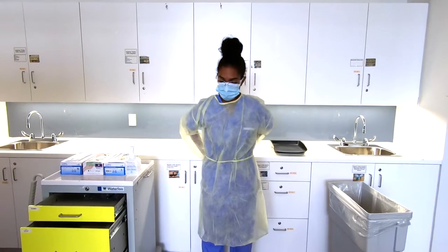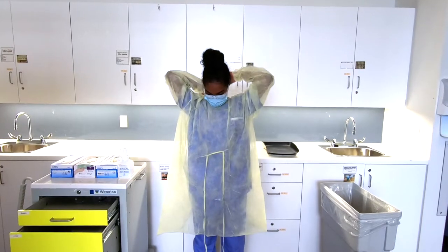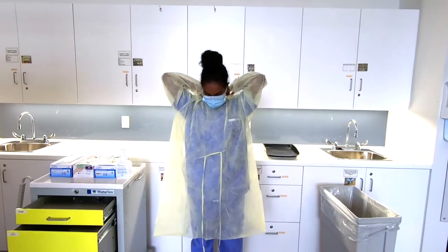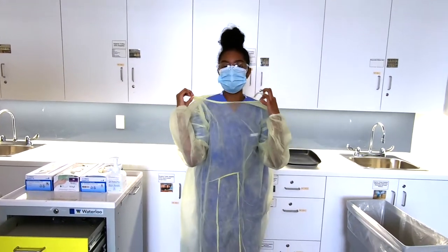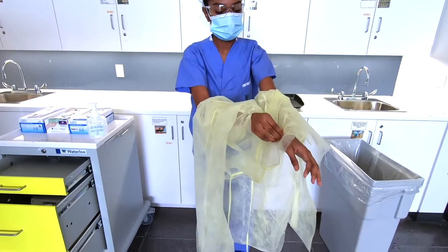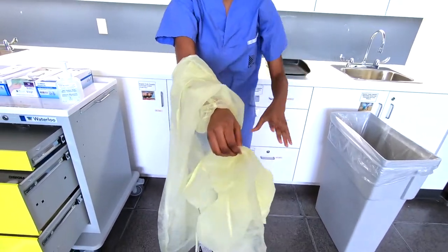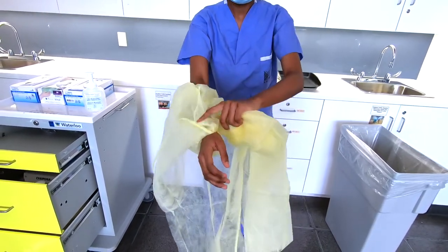To remove the gown, remove the ties at the waist and the ties at the neck. Then grab the back of the neck cuff and pull away from your body. Grab the cuffs and move your hands, ensuring you are not touching the outside of the gown, and repeat.